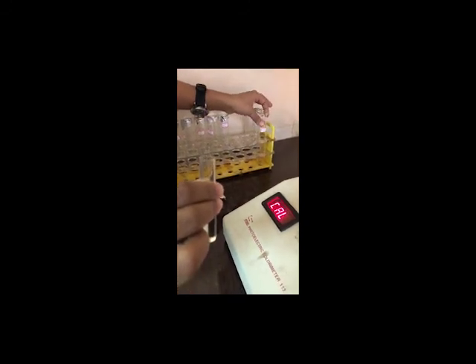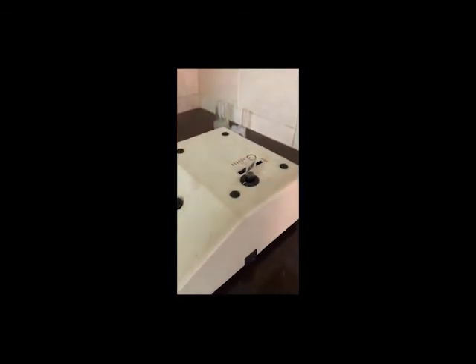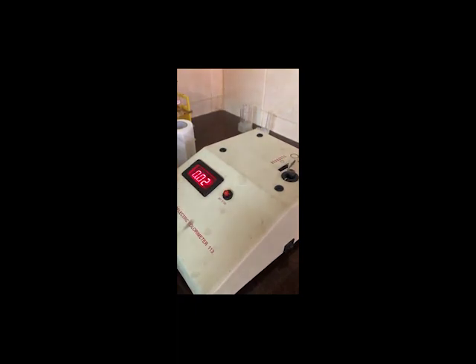First we take a clean, transparent cuvette and clean it before placing it in. Set the OD as 0.